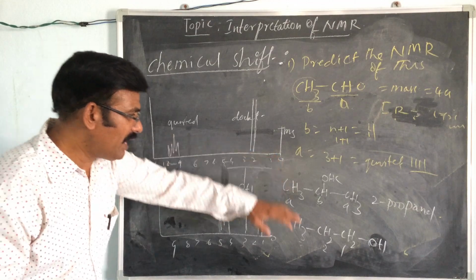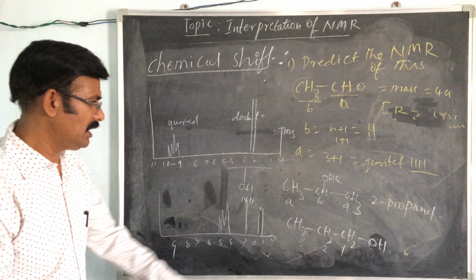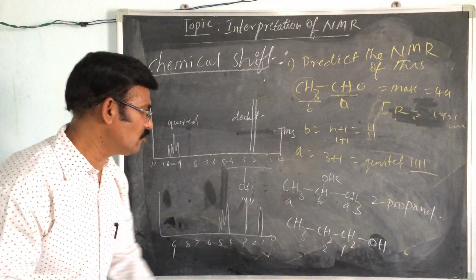And here also, CH2 and CH3 are there, only the CH2, not a CH group.